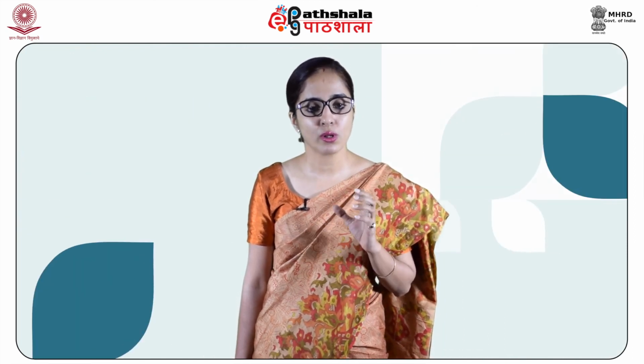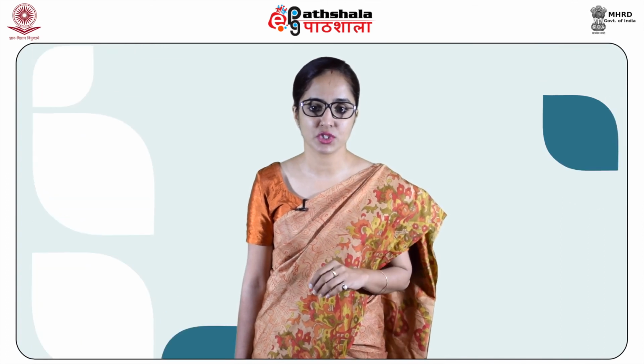If the acetylenic function is internal, that means it is not a terminal triple bond, then the absorption can be extremely weak. However, if we have a terminal alkyne, that means the alkyne is at the end of the chain, the band may have moderate intensity, and this is supported by the characteristic CH stretching around 3310 cm⁻¹. A relatively low frequency CH bending vibration near 630 cm⁻¹ also confirms the terminal alkyne vibration.